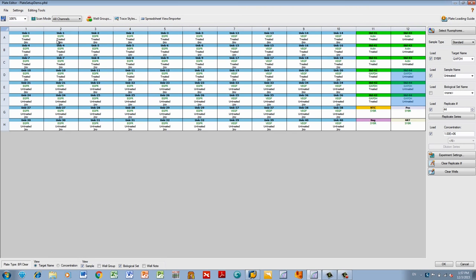Repeat this for all your technical replicates. Once you are done, save your plate and click OK.